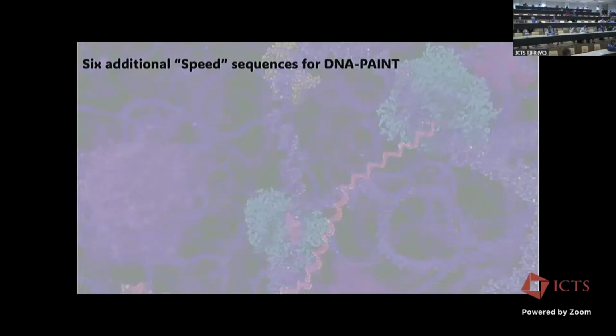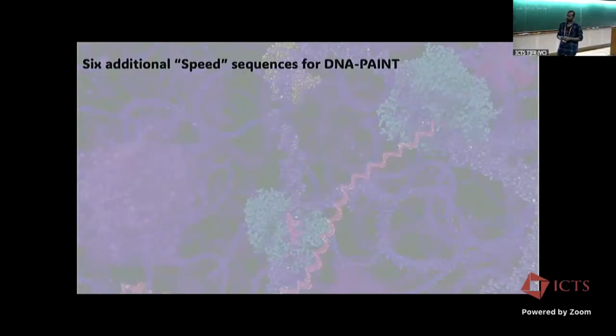Can you actually look at perturbations that likely would not affect global architecture, only locally? Can you pick those up? We are actually thinking about some of those experiments where we can do some site-directed work in the cells, but that's still a long way ahead.